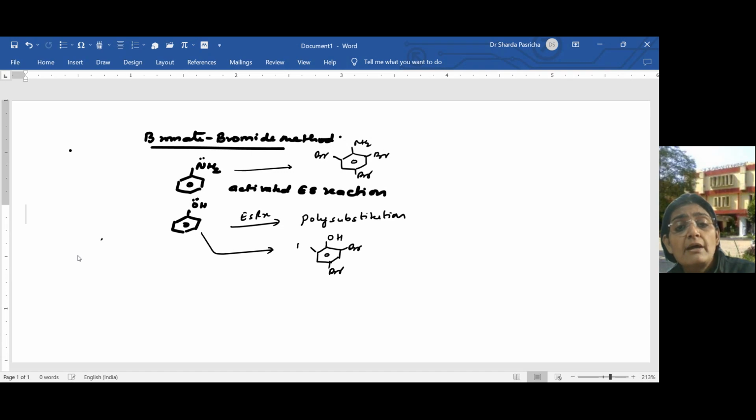Now, you also know that the presence of polar solvents like water or acetic acid helps in the generation of the electrophile and helps in the progressing of the electrophilic substitution reaction. The electrophile being generated is required for the ring substitution reaction to take place.